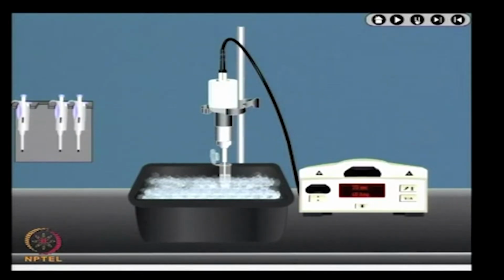Wash the bacterial pellet with phosphate buffer of pH 7.4 for 4 times to remove the media. Resuspend the pellet with protease inhibitors and lysozyme, and cells can be further ruptured by sonication on ice to prevent foaming and heat. The sonication step helps to release the contents of bacterial cells.